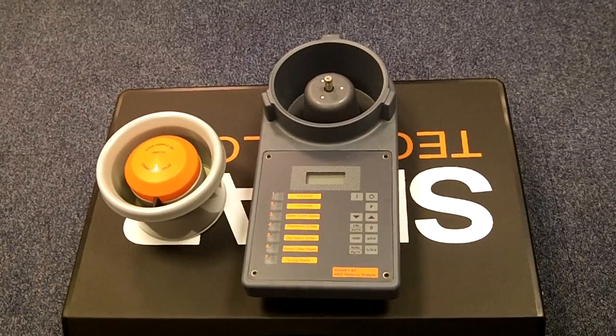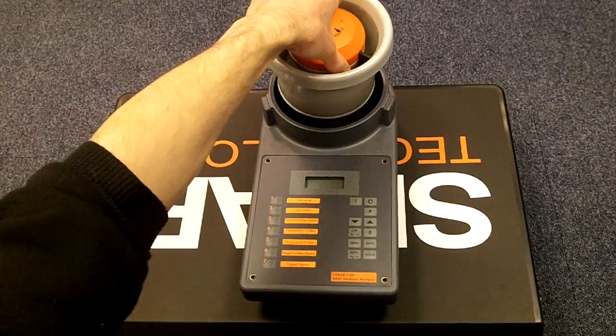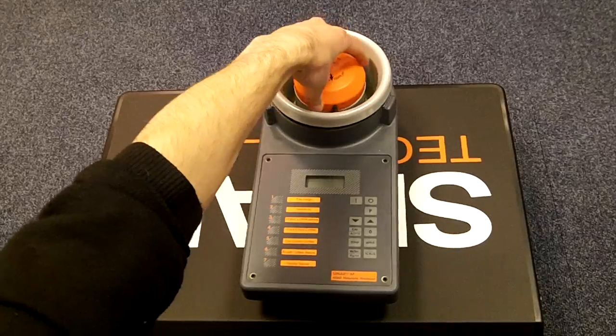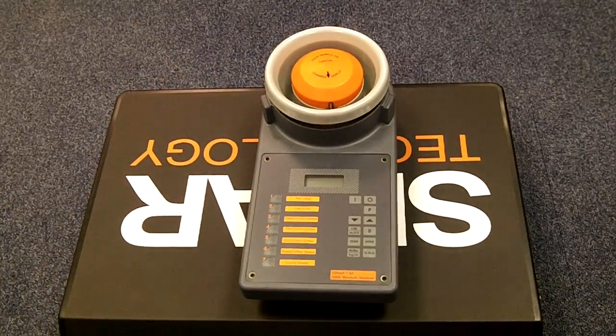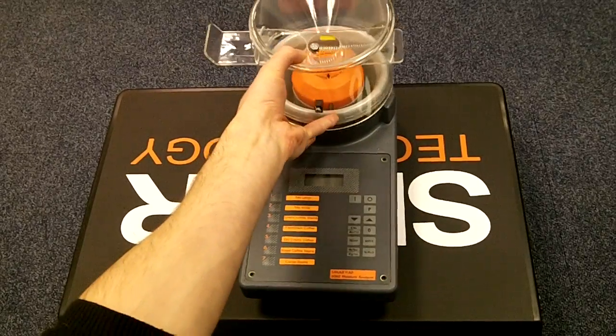I'll now demonstrate how to take a reading with the instrument. To put the cell on top of the instrument just place it on top and with a slight clockwise motion just push down gently. Take the filling hopper and close the slide and place this on top.